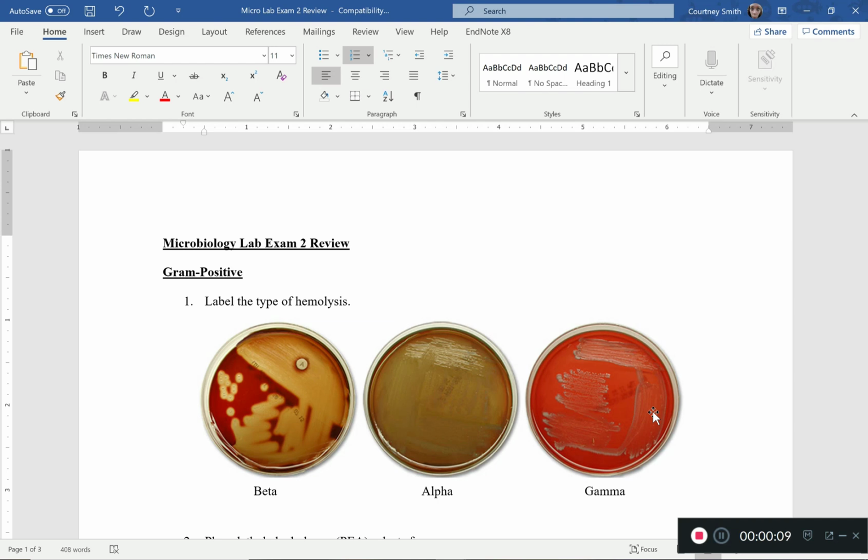So in this video, I'm going to be using the study guide that is posted on Canvas. I'm going to be using it as a backbone, kind of just like all the other review videos, and I'm going to point out the highlights to which labs you should focus on. The labs that you should focus on are definitely the gram-positive and gram-negative lab. Those are probably the biggest ones. Also, the disinfectants one, I went over what you should have received from that lab, but I'll also touch base about it in here.